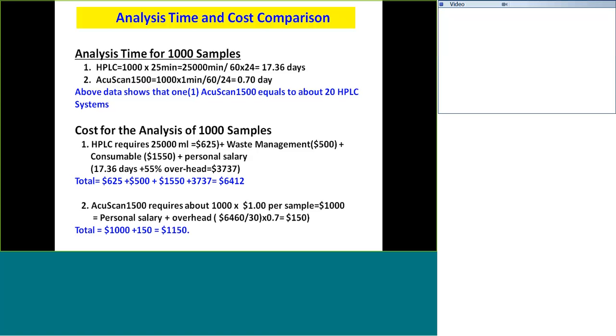And that could cause a lot of non-uniformity in the distribution of the drug ingredient inside each tablet. So there could be tablets very high in active ingredient and some very low in active ingredient. And that doesn't meet the FDA requirements at all today.